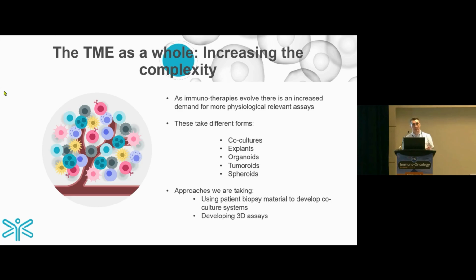So back home in the UK, we have our NHS, which gives us very detailed information about patient care. And we have set up a collaboration with what's called the Glasgow Biorepository. So all the main surgeries are done in this very localised place in Scotland across the Central Belt, and that allows us access to primary biopsy material, excised material from operations, not just for IO, but for autoimmunity as well. And because we're so local, we get the tissue straight from clinic, and it's in our lab within 2 hours. So it's pretty much as fresh as can be when we get it.